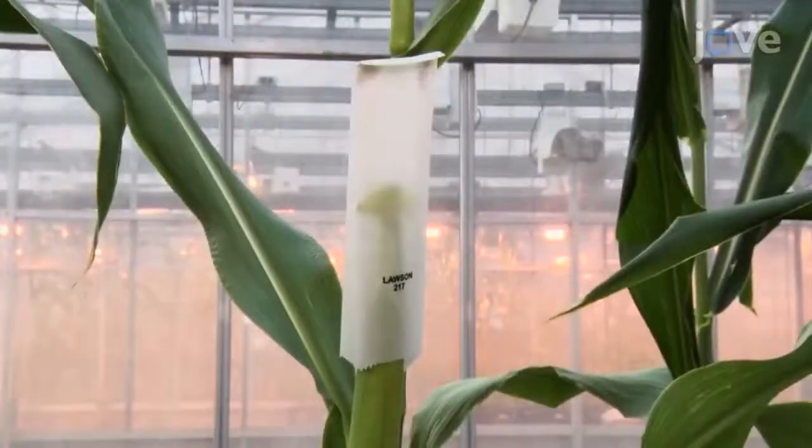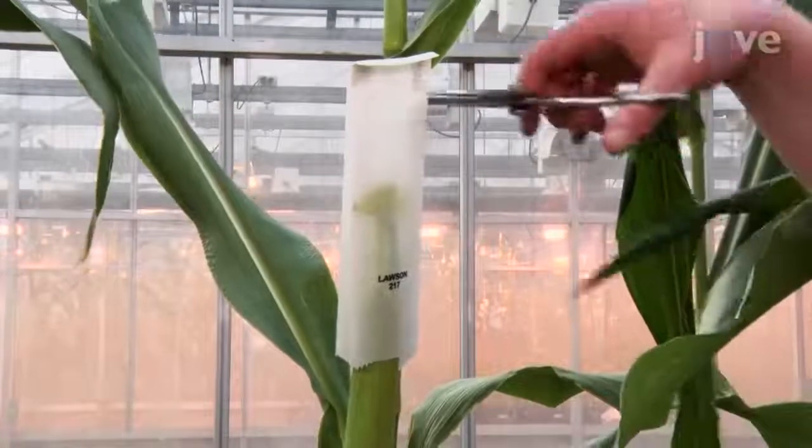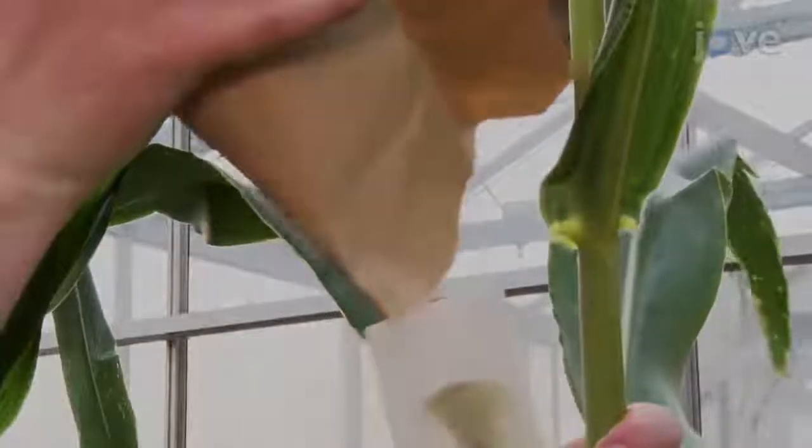To pollinate a recipient plant, expose the silks and quickly pour pollen from the tassel bag onto the silks. Immediately cover the silks after pollination.